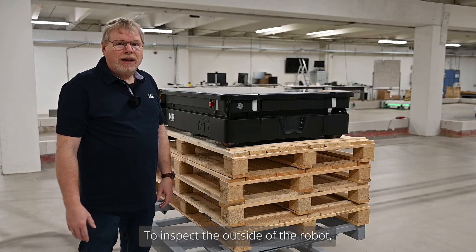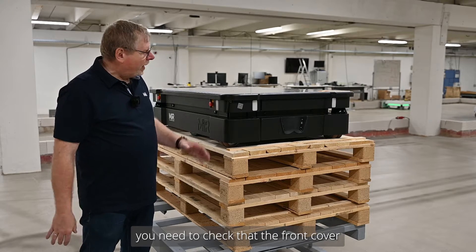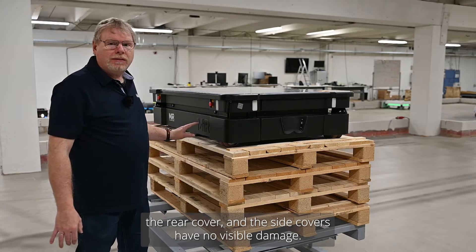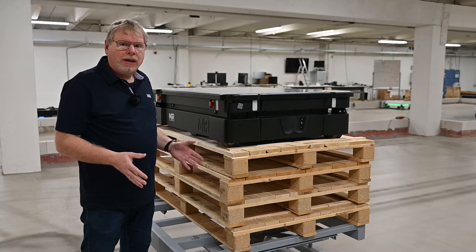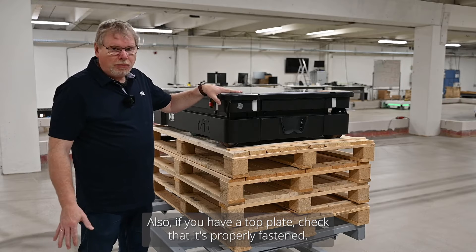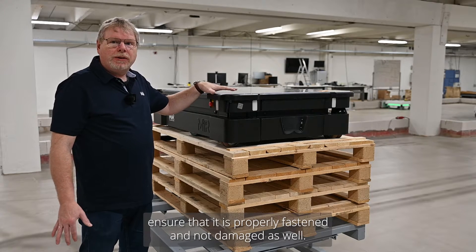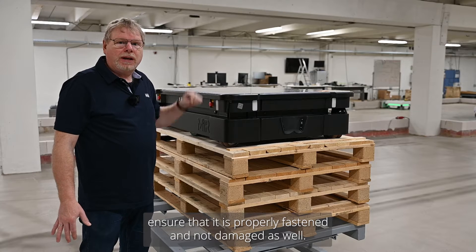To inspect the outside of the robot, you need to check that the front cover, the rear cover, and the side covers have no visible damage. Also, if you have a top plate, check that it's properly fastened. If you have a top module, ensure that it is properly fastened and not damaged as well.